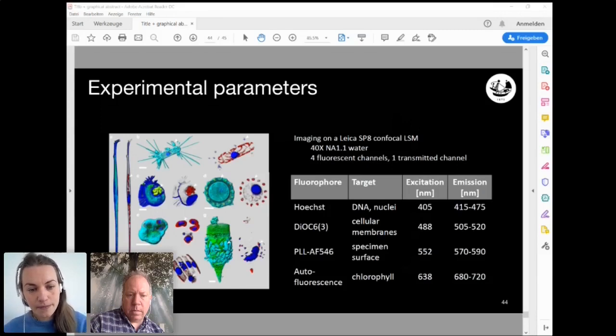Okay, so Jolene Dixon was asking what the size range of cells is that you're looking at. Confocal is best suited for anything between 1 and, let's say, 200 micrometers. The size range we are looking at, where the diversity peaks, is between 5 to 50 micrometers. So this is what we're focusing on.